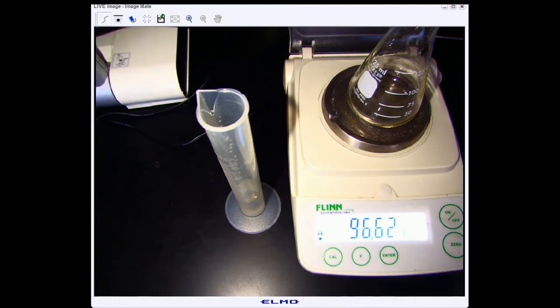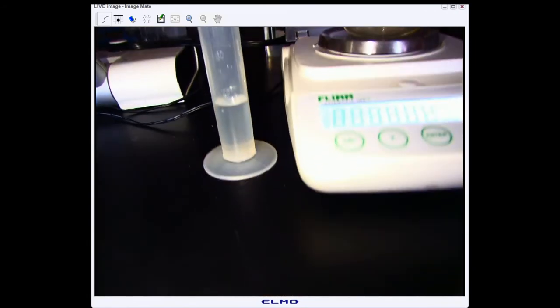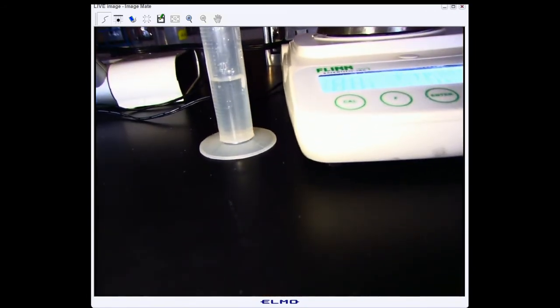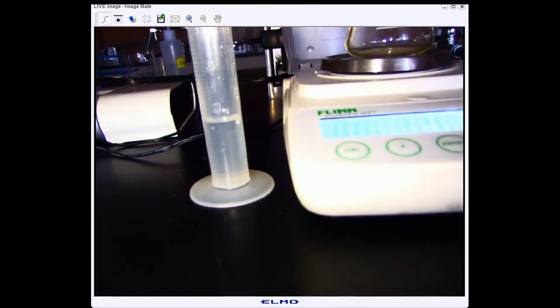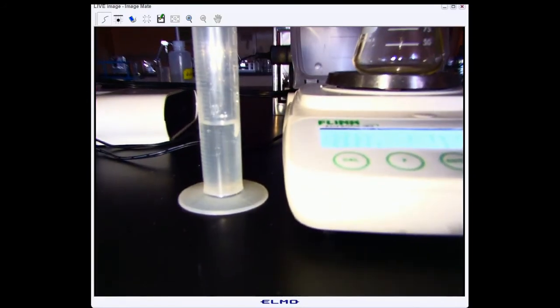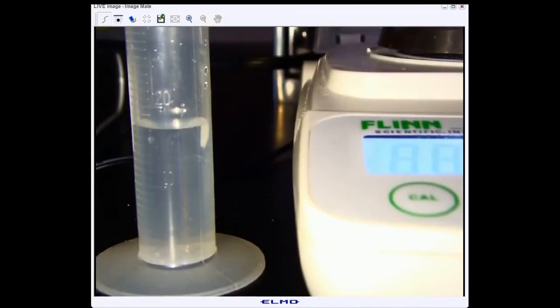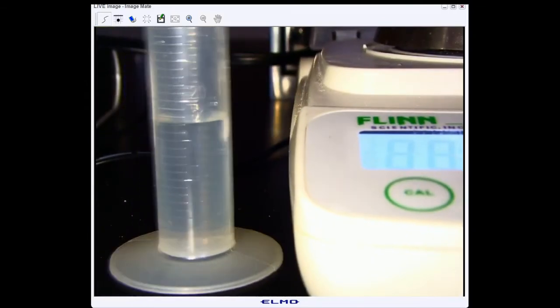Now we're going to measure approximately 15 milliliters of vinegar into the graduated cylinder. You do need to make some observations about what our reactants, our starting materials, look like. So go ahead and pause for a moment and write an observation about the vinegar in this cylinder.